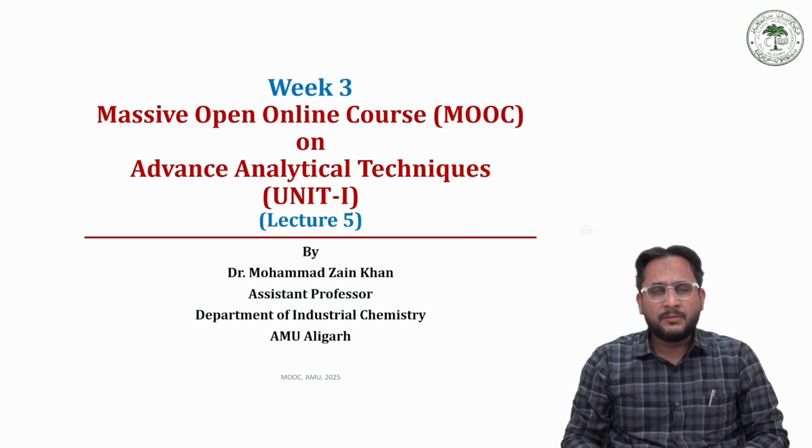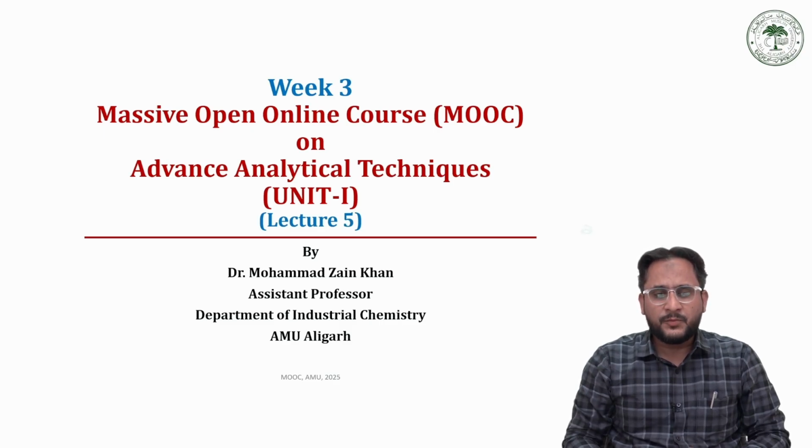Today, I am going to discuss the advantages and disadvantages of ICP AES and show you a few spectra to give you an idea about how we make the analysis. Let us begin this lecture.